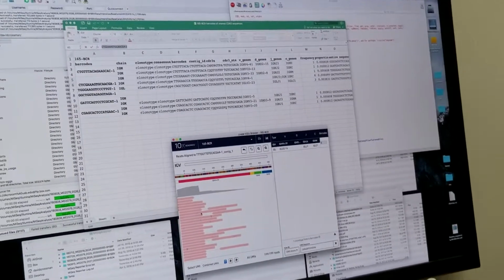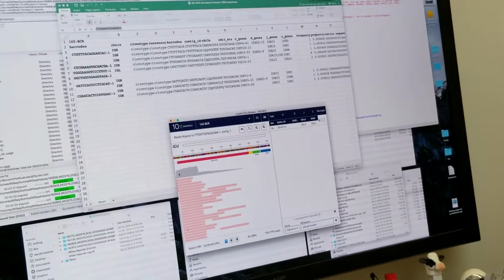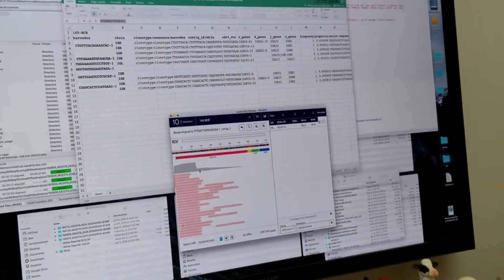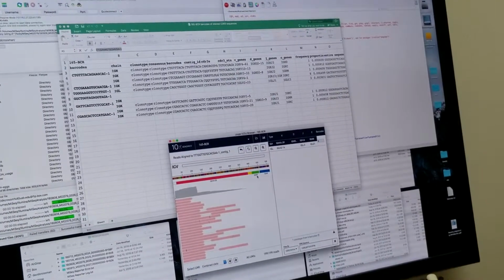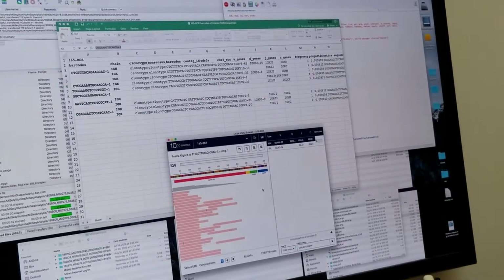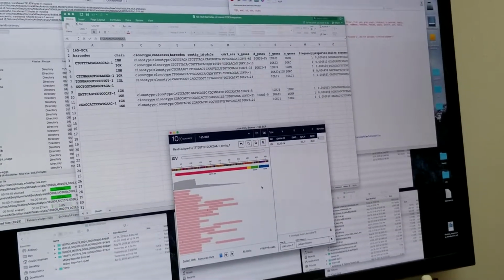That's interesting because now I can start to see. Oh, what's that gray graph above? Is that the number of reads? That's the depth. You see depth of coverage is really high here at the 5' end, and it starts to tail off here. And you don't have very much coverage out here in the J and the M, the heavy M. Would it help to sequence deeper? You know, because I can see the problem now.